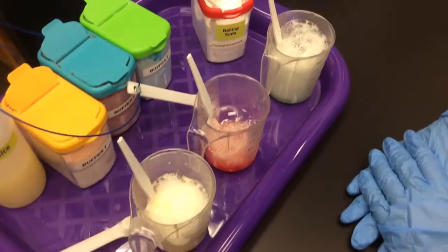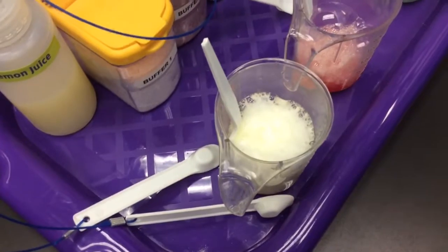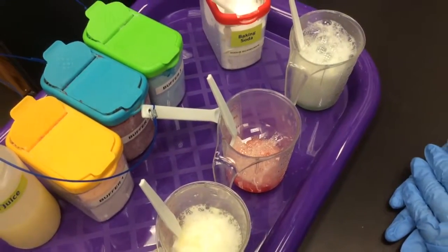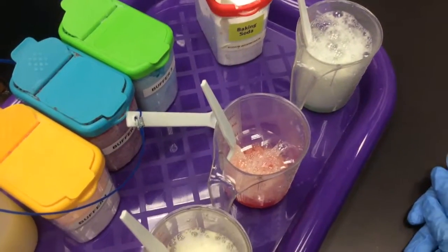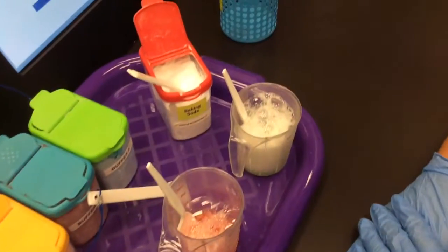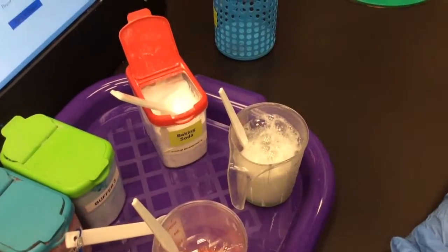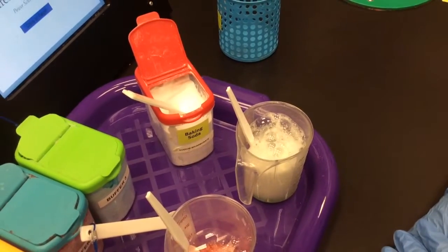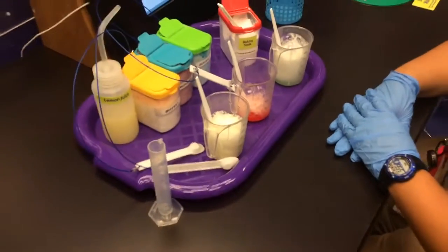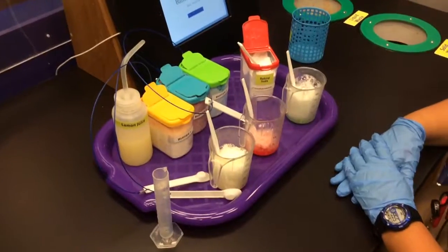Now what we can see is that some bubbles look a little bit thicker than others. So looking at this first sample, those bubbles are pretty thick. The second one are not so thick, and they actually look to be dissolving pretty fast now. It's going down. And then the last one, after it produced a lot of bubbles, the reaction seemed to have stopped. Or it's still kind of going on, not as fast as when it started. Okay, good. And so those are observations that we want to make after the experiment.